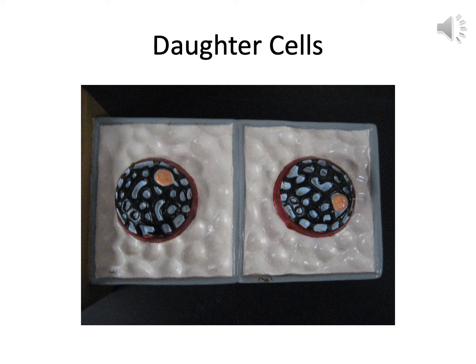Notice these really are 2 cells. We've got the red nuclear membrane around both of them. We've got the chromatin back. We've got the nucleoli back. And we do have a complete cell wall between the 2. Well, they sure look like squares now instead of rectangles. They'll get bigger and become rectangles, but we do have daughter cells that are identical to the original cells.